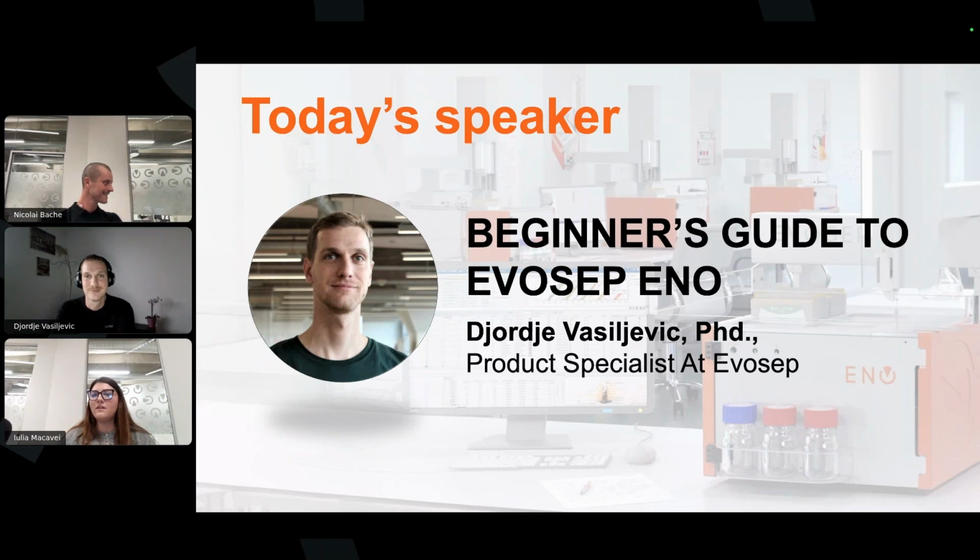Yes. For the MS part, it highly depends on the MS with the voltage. I guess most mass specs have that preset, or you can configure it to stop at the end of a batch so as not to apply voltage while there's no flow. Yeah, exactly. I guess it really depends on the column, as Djordje says.